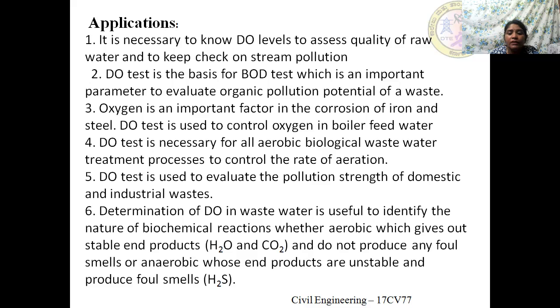Determination of DO in wastewater is very useful to identify the nature of biochemical reactions, which means when we understand the nature, we come to know whether the reaction is aerobic or anaerobic. So whenever it is an aerobic reaction, it gives out stable end products.